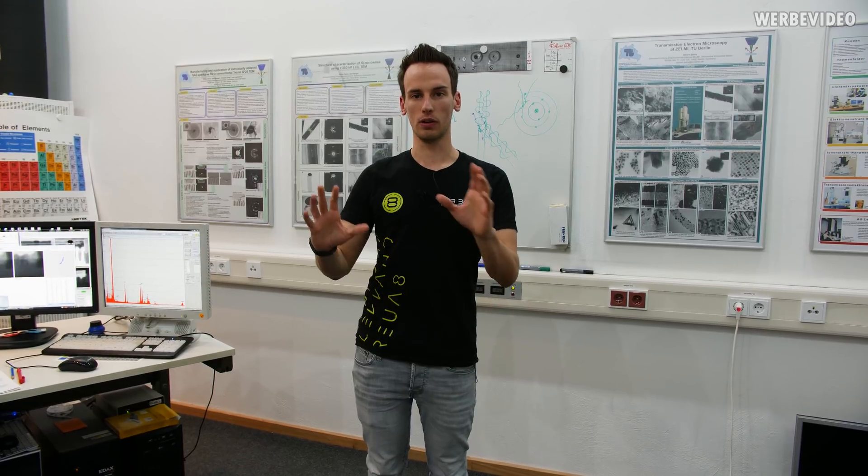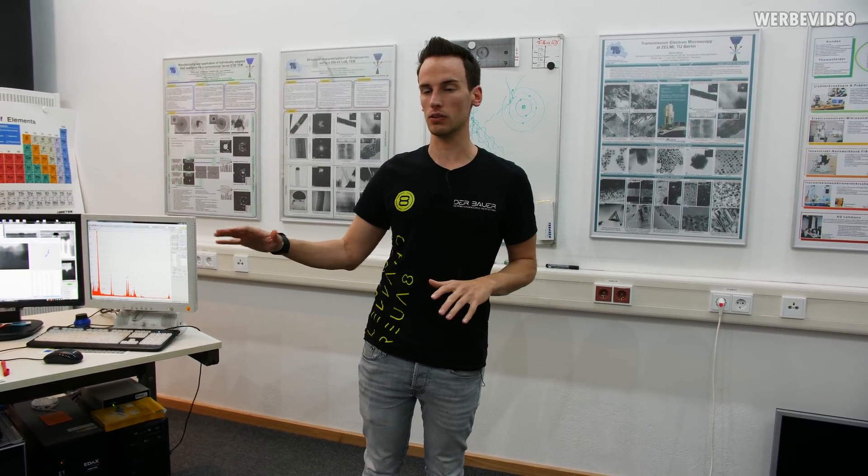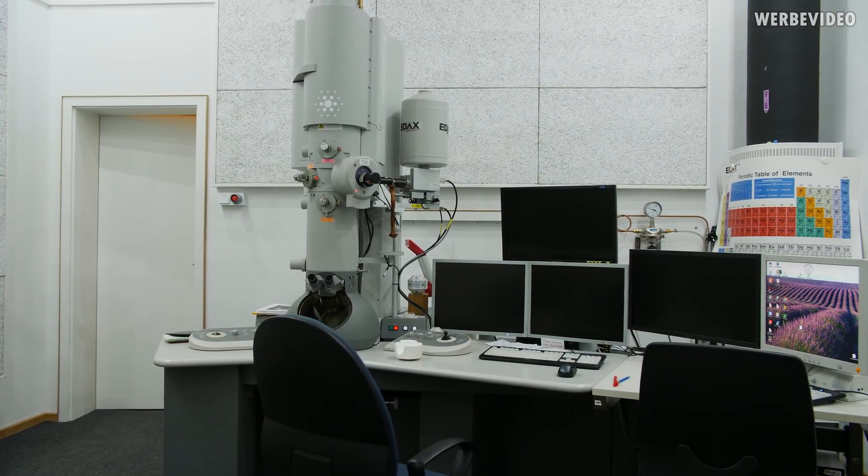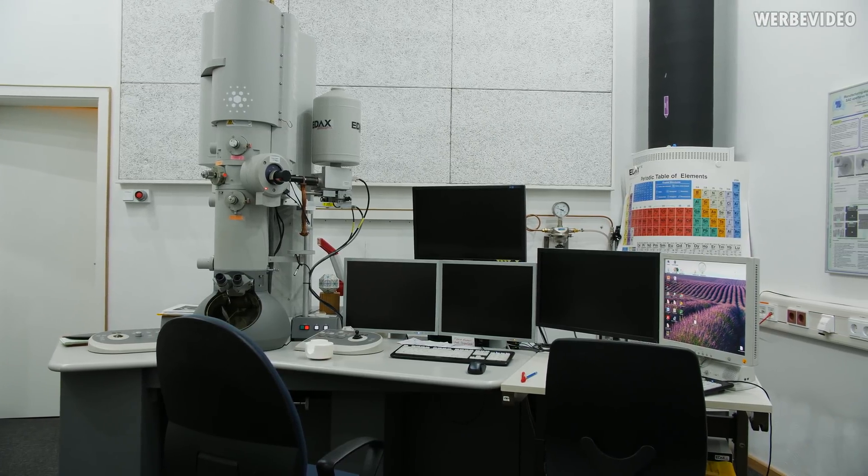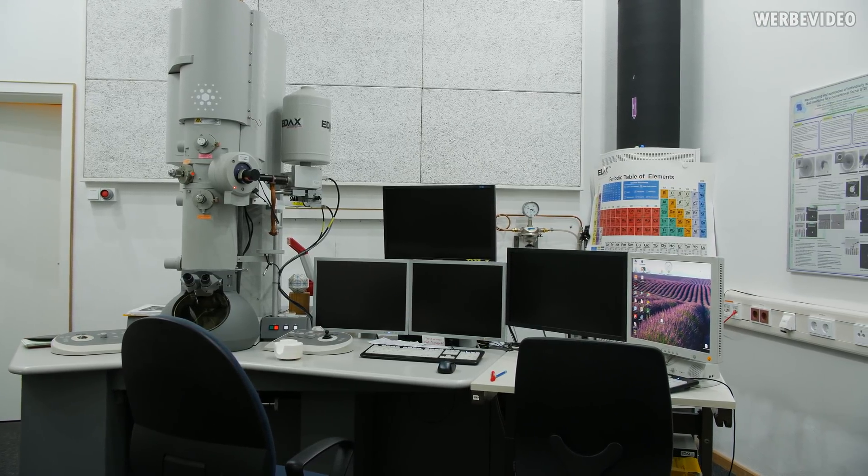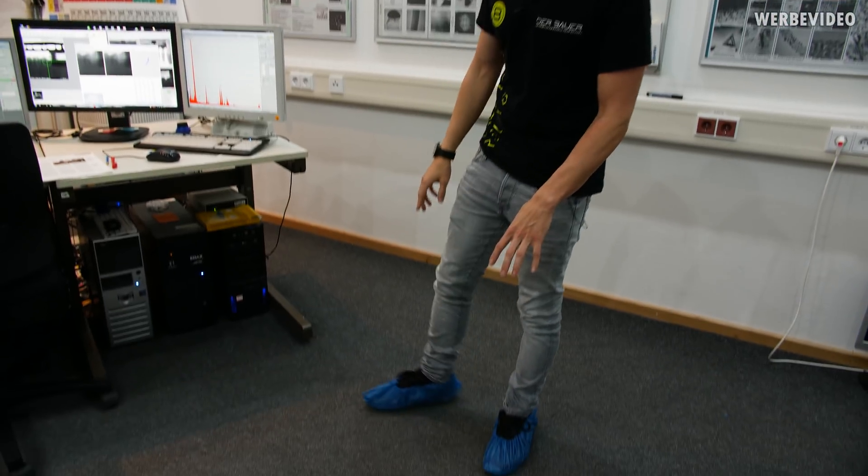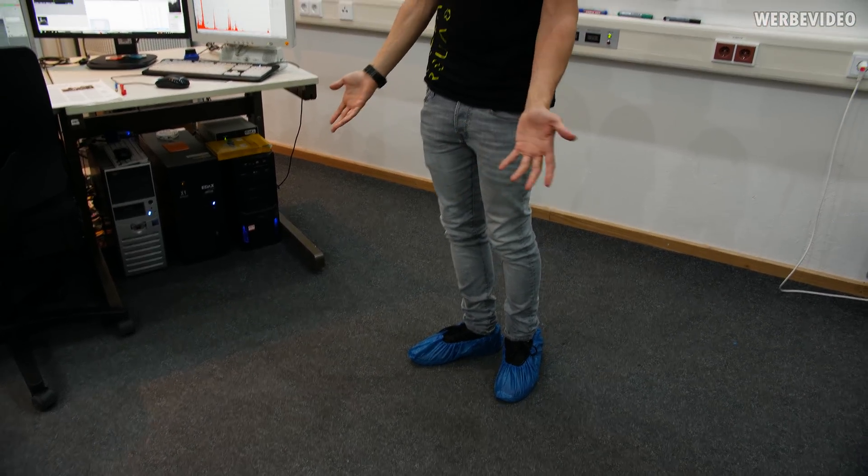I just gave you a small introduction to the building outside and we are now in the room where the TEM is located. To my right or your left, that's the microscope right here and we will get to that in several minutes when we analyze the 9900K. What is already really impressive is the building itself and the room itself.